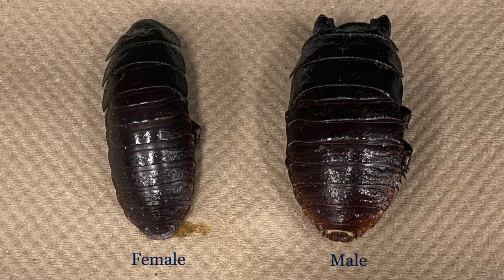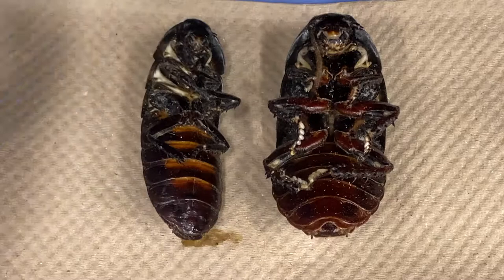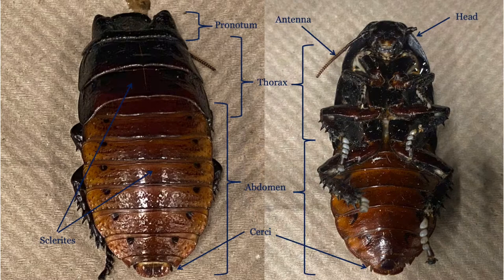Let us examine some of the features that differ between males and females of this sexually dimorphic species. To begin with, males are larger than females. Males have large bumps or horns on the pronotum, known as pronotal humps, while in the female they are much smaller. Turning the cockroaches over, the males have a series of three plates at the end of their abdomen, while the female has just one larger segment. Take a look at your cockroach and determine if it is a male or a female.